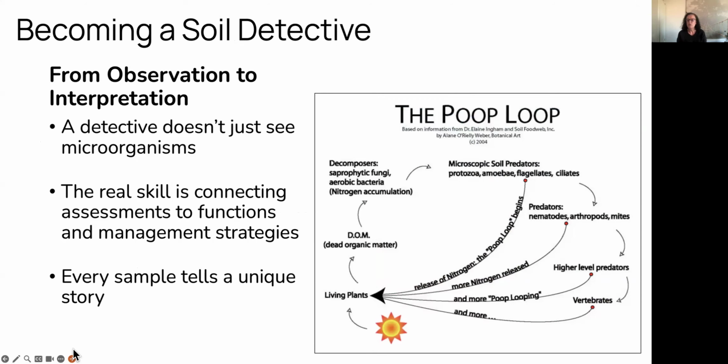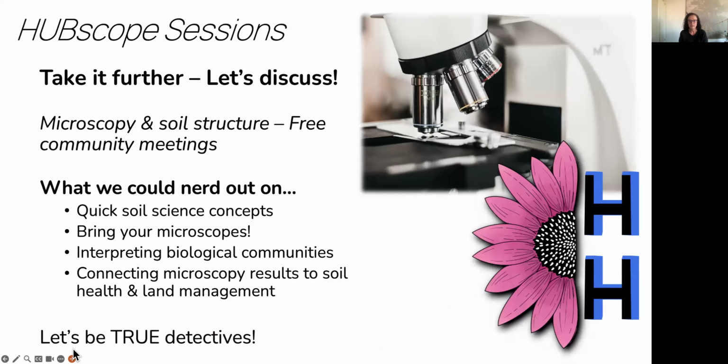So I'd love for all of us to become soil detectives, and we need to link our observations to our interpretations. A detective doesn't just see the microorganisms, it's connected to the other things that we know about it. The real skill is connecting assessments to functions and then connecting them again to our management strategies. Every sample tells a unique story, and I'd love to uncover it with all of us. So let's take it further. I'm inviting everyone to participate in this microscopy and soil structure.